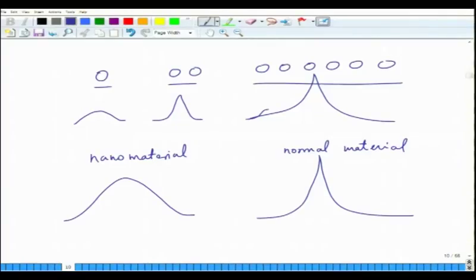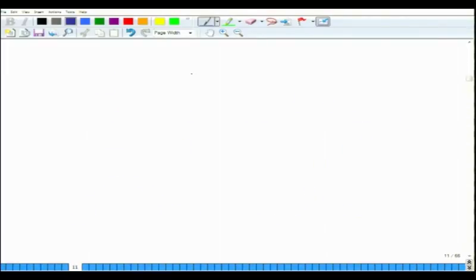As the number of slits increase with the same spacing, the peaks get sharper, and there is a whole physics behind this. It says that your X-ray envelope gets sharper as your number of slits increase. I unfortunately cannot go into details of that, but there is a whole analysis behind it. So when you have scattering, you have beams going in all directions. This is scattering.